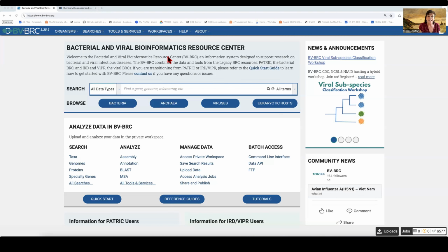So when something like this happens, they have to go in and remove the artificial joint, clear the infection, and then put it back in again or put in a new one. And so what they did when they removed it in this study was they collected bacterial samples from it and then looked to see what bacteria were present in this sample.